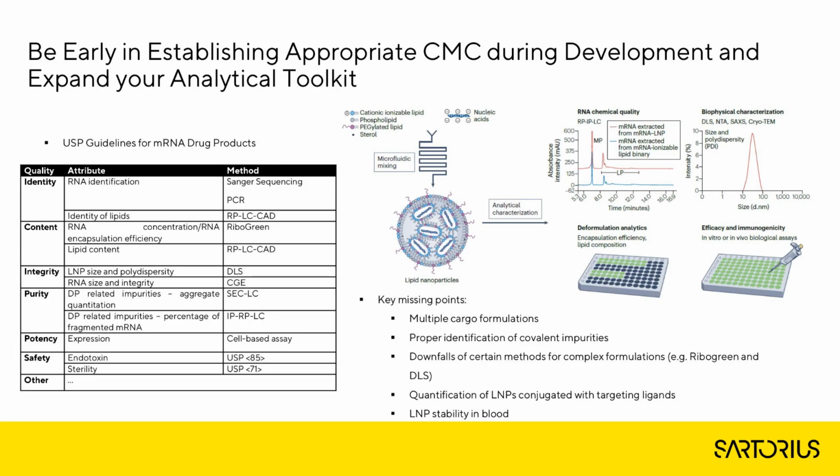As I mentioned, there is a different chemical environment within the LNP, so you have actual chemical impurities forming, which are not often looked at in such large biomolecules. So that is one of the challenges as well.